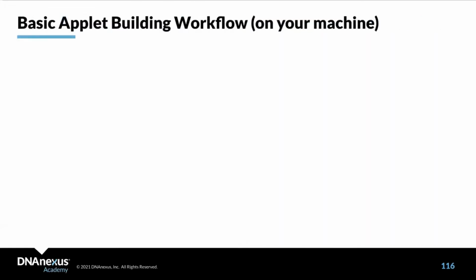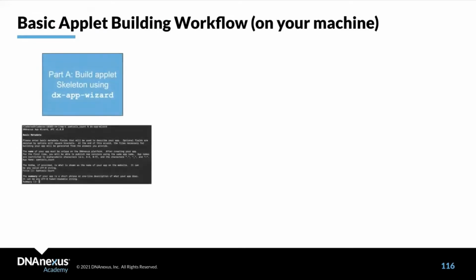Okay, so this was our step 0, let's say, before you are actually doing any applet building.